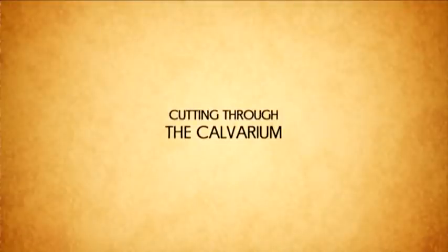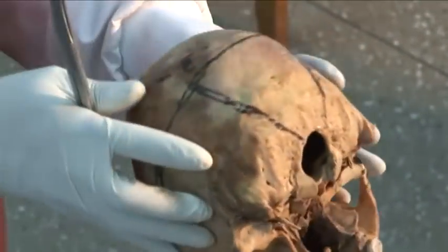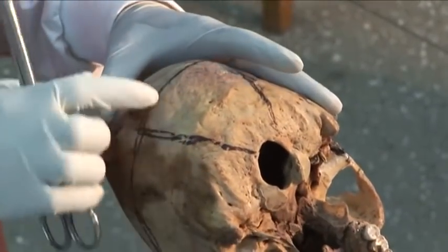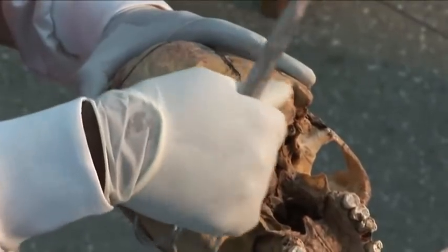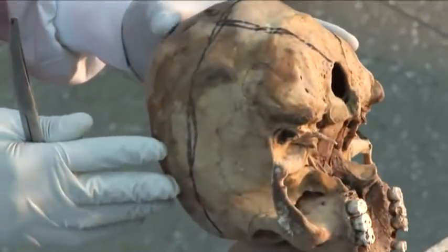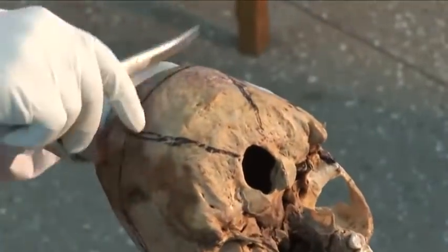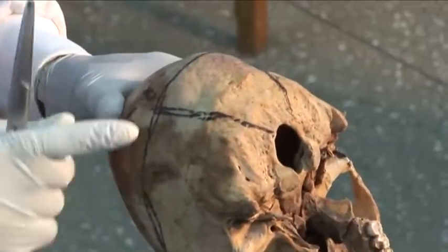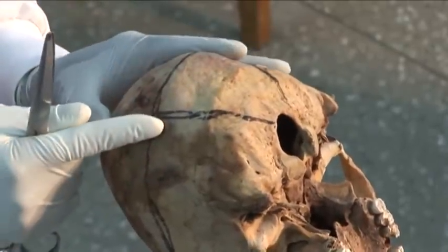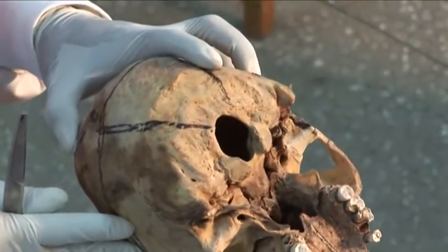Cutting through the calvarium. The idea is to remove the calvarium, cut through the occipital bone, and connect the foramen magnum. So make the same cut, at the same level as we cut the scalp, and then make a wedge incision from the cut end of the calvaria and open into the foramen magnum.